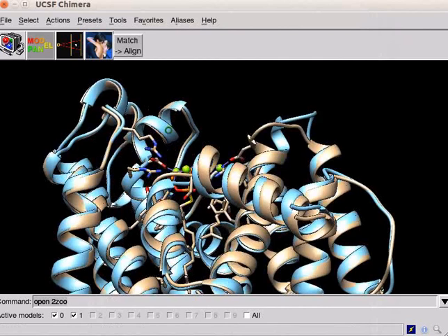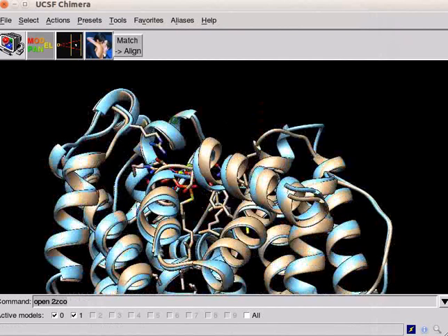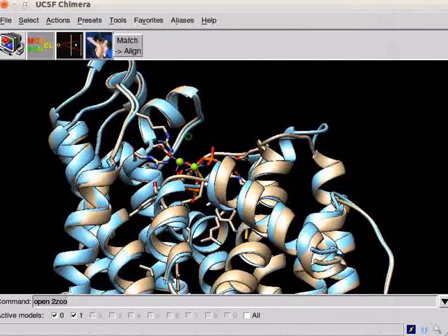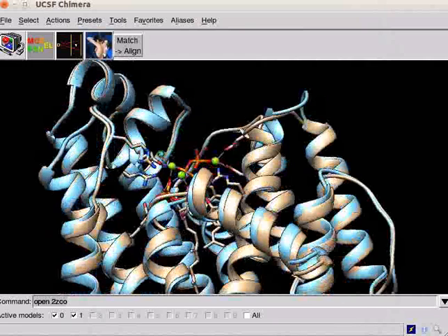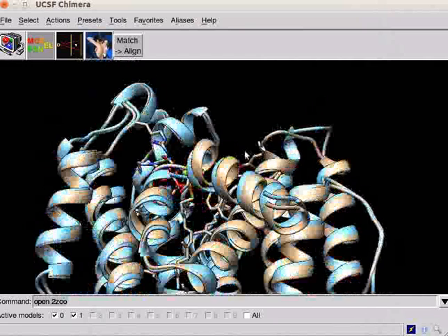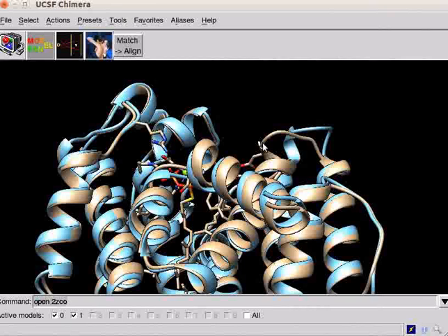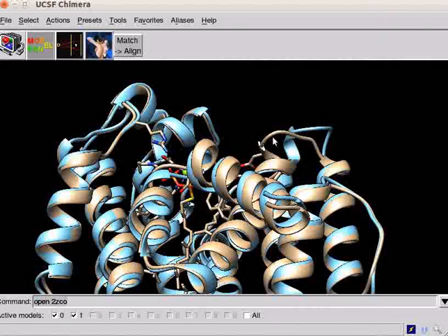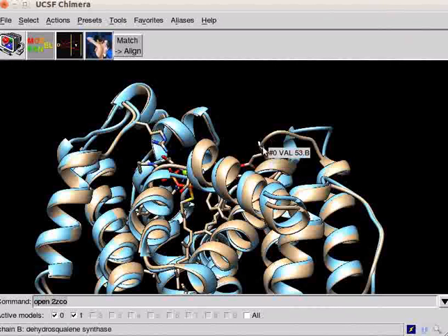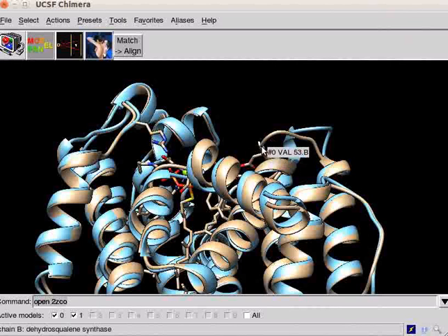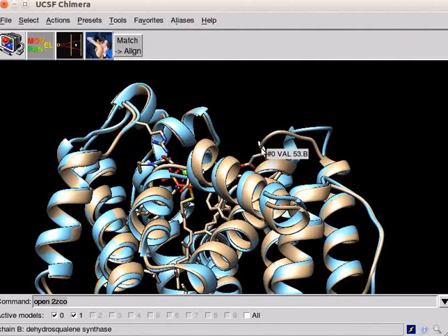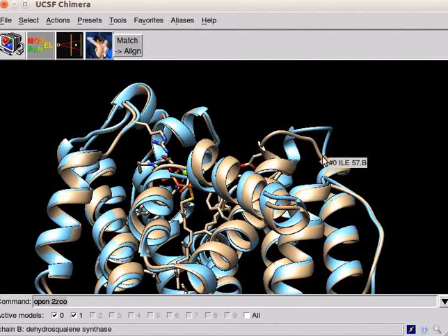The two structures are almost completely superimposable with each other except for a small part which is non-superimposable. The fragment involved in this non-superimposable part starts from amino acid number 53 to amino acid number 57.